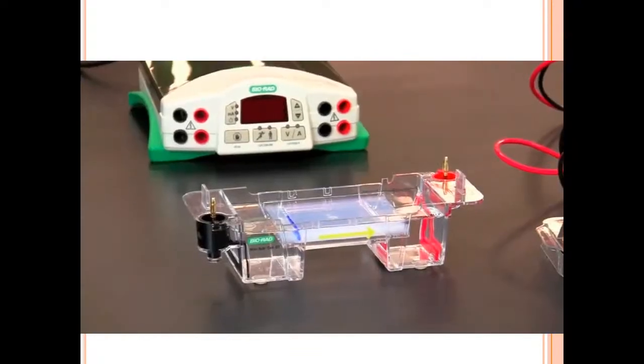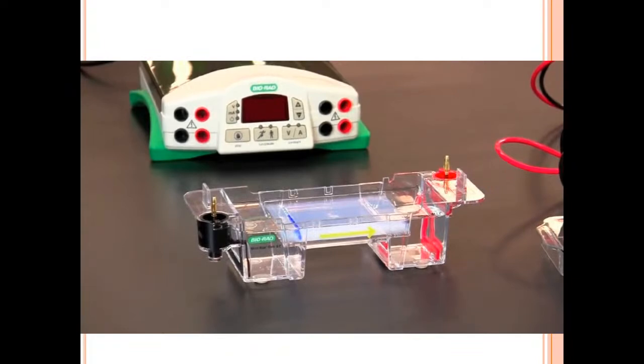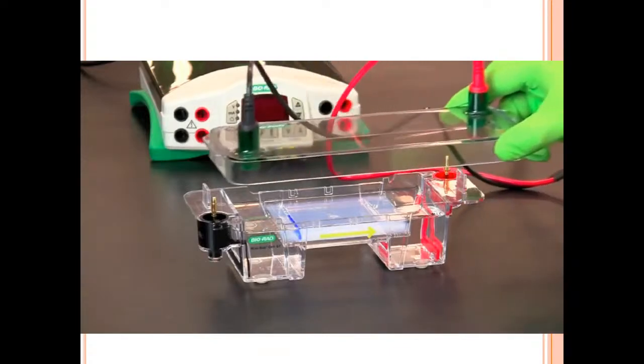Slowly apply pressure to the plunger button and observe as the sample fills the well. Make certain you stop at the first stop on the pipette, pause, then slowly remove the pipette while keeping your thumb down on the plunger. Once all the samples have been loaded, avoid any bumping or movement of the gel chamber. This might result in the samples spilling into adjacent wells.